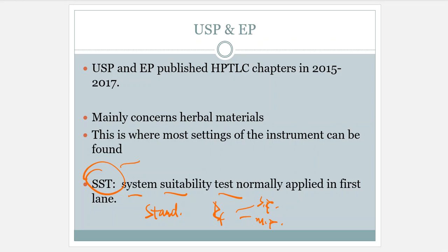The system suitability is very often a USP standard, so very expensive, very pricey, but it is super pure. It is going to be as clean as it's going to get, and you have the intention here of applying a totally legit, pure sample that has been identified as being pure onto the plate, so that way you can make these things match.